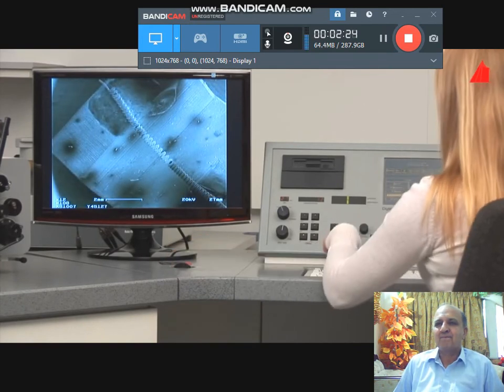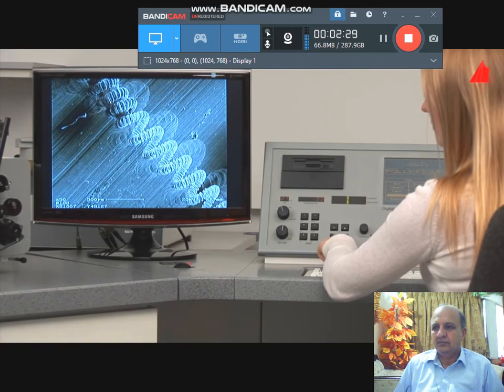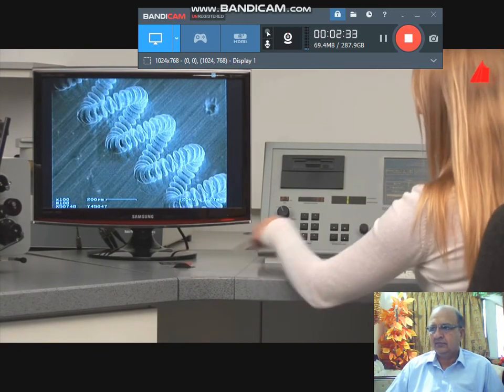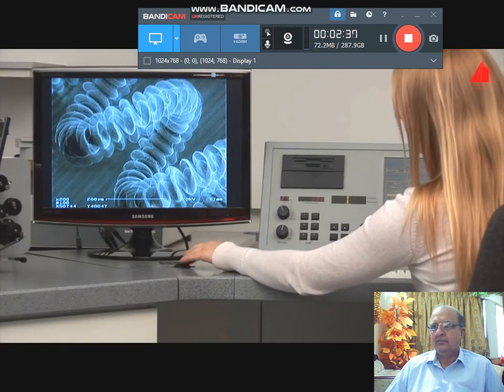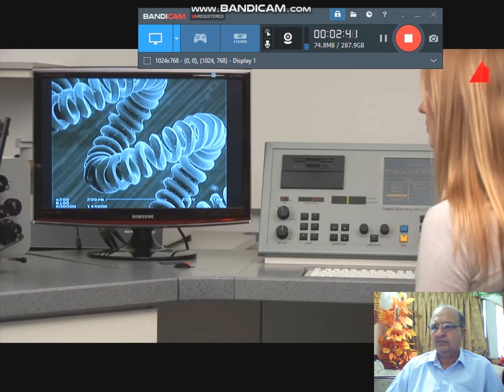The magnification is gradually increased. The position readjusted, and the magnification increased again. Now a plastic and high contrast image of the filament can be seen on the monitor.